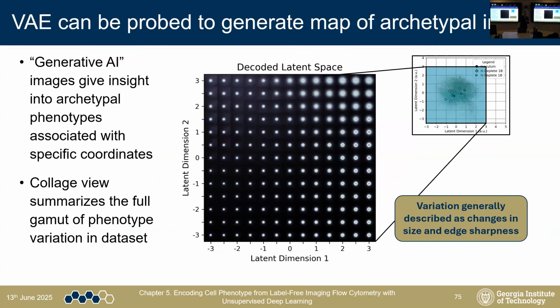Okay, so we looked at the encoder. Now what can the decoder do for us? The decoder is able to generate images when you give it a coordinate. So, for example, we can probe it for coordinate 1, 1, and it will show us what a picture of an algae cell will look like when it goes into spot 1, 1. This is useful because it can give us a visual map of what that cloud of points actually means, because just numbers is not very meaningful. This gives us a collage or an overview of all the different phenotype variations seen in this experiment. And there wasn't any annotation or labeling involved. This was a completely emergent property of the system, unsupervised learning.